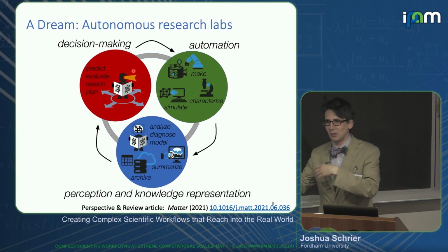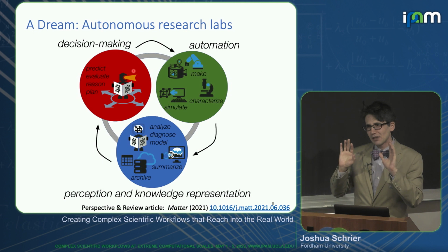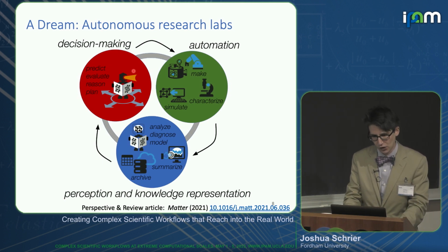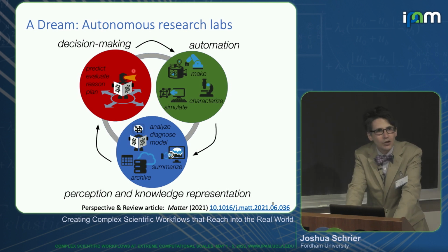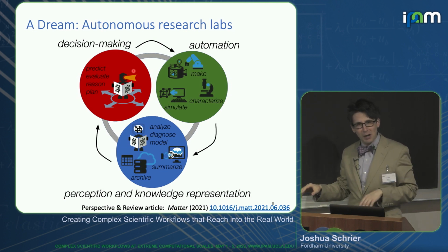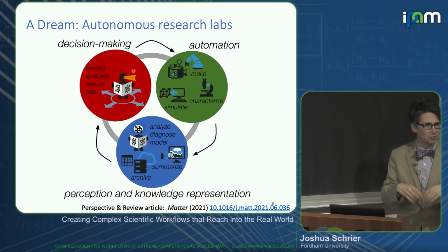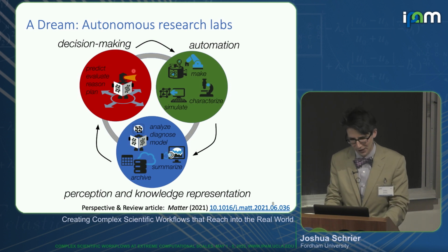And maybe that's a way that we can get this comprehensive data set and also eliminate some of the influences of human choices that are steering us wrong, right? So that's at least one idea that's been posited. And I guess what I'd like to say is, often this is sold as this vision of, we're just going to set up the robots, and then we'll go home, and then we'll come back next week, and all the results will be there, and it'll even have typed up the paper for us.